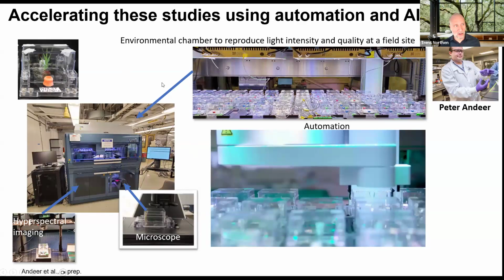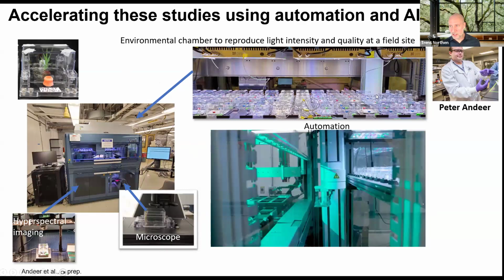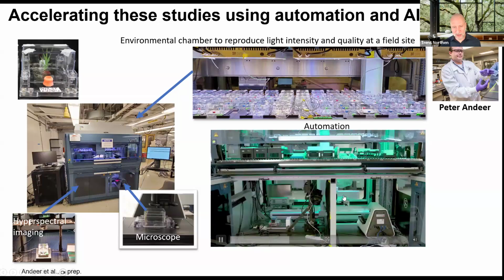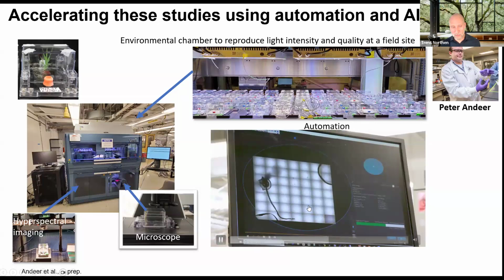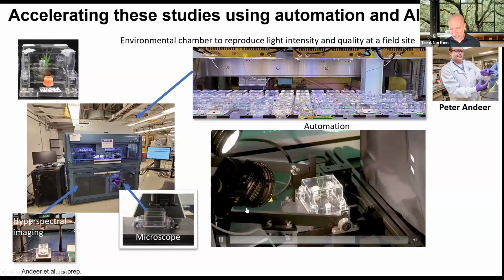And so we built this thing called the EcoVibe. It has a growth chamber with all these little ecofabs with the plants. We have a built-in microscope, a hyperspectral imaging system. There's a robotic arm that, so each of these little ecosystems, these ecofabs, has a barcode, and this robotic arm gets the ecofabs off of the deck, changes the media, collects samples for metabolomics, images where the microbes are located, the root morphology, and then the hyperspectral camera tells us about the health of the plant.